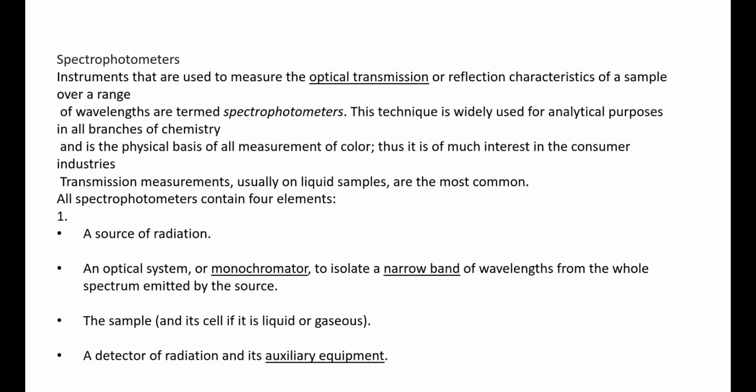Now, this is a very useful analytical instrument when it comes to chemical analysis or even biochemical analysis, for characterization of analytes, for finding out their concentration, for finding out the purity, for comparing, or to monitor the kinetics of certain biochemical reactions, to find out the structural variations in a given molecule. How spectrophotometer works to serve all these applications, we will learn as we progress in the discussion.